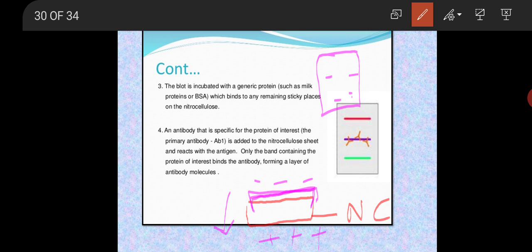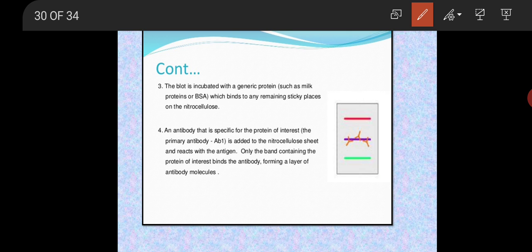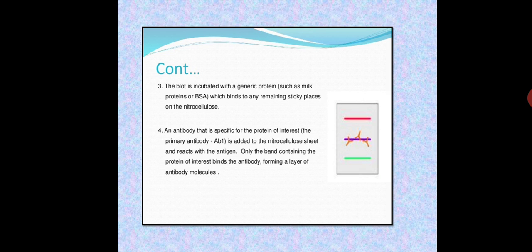So the protein will migrate from upward to downward and automatically from gel it will get transferred onto the membrane, because this gel and the membrane are connected to each other in a tight manner. Okay, so the movement will be from upward to downward. Let me erase this. Now once the protein molecules have been placed onto the nitrocellulose membrane, the transfer process has been completed.